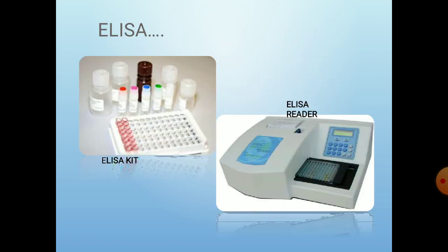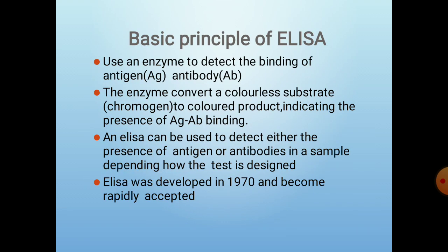This is an ELISA kit where we add antibodies, antigens and enzymes, and this is an ELISA reader from where we get the readings.